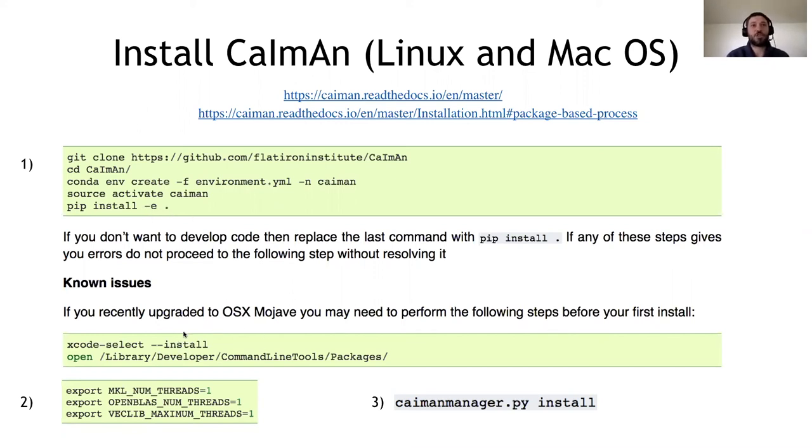You might have some issues if you're running on Mac, but I doubt since probably most of you are developers, you probably have this already installed. In order to optimize performances, you want to set all the number of threads for any possible linear algebra library you have on your computer to one, so that processes don't interact with each other. And finally, with this command, CaimanManager.py install, you install an infrastructure that includes the demos, demo files, the movies that you might want to download.